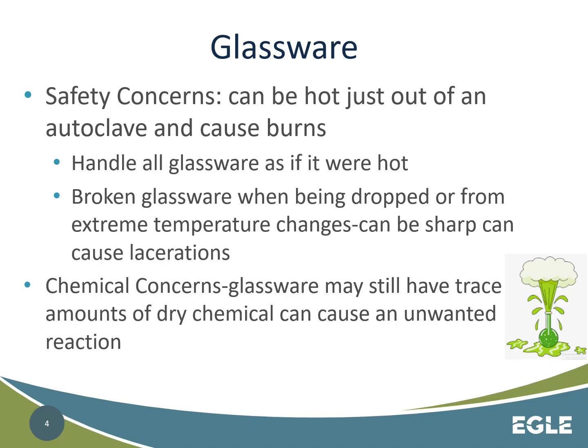And again, like I was talking, even dropping glassware will shatter it, which can cause different shards and different types of stuff that could cut you, all right? And then chemical concerns, like I was saying too. Sometimes the way these things are cleaned, there will be residual chemicals on the glassware itself, and that residual chemical could create an unwanted reaction. And depending upon what it is, the reactions can vary widely, from creating excess heat, from explosions to creating toxic gases. It all kind of just depends on what it would be.